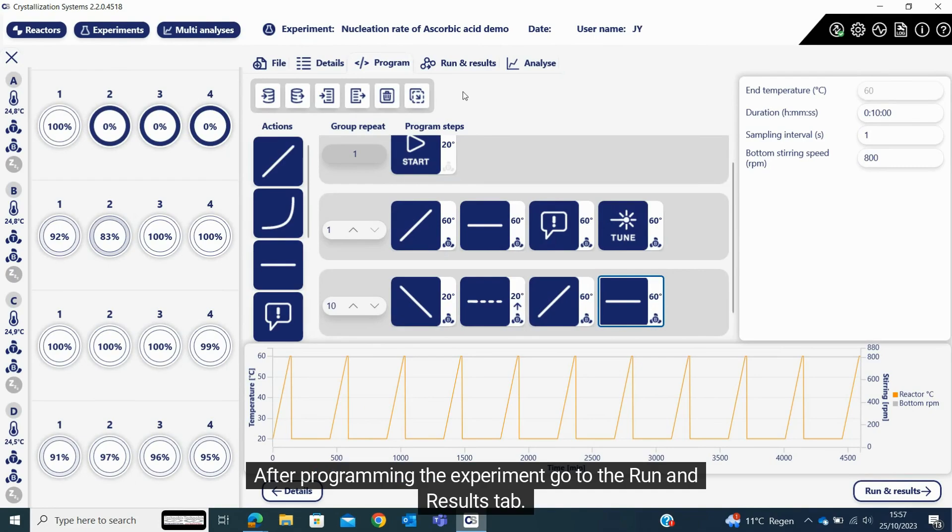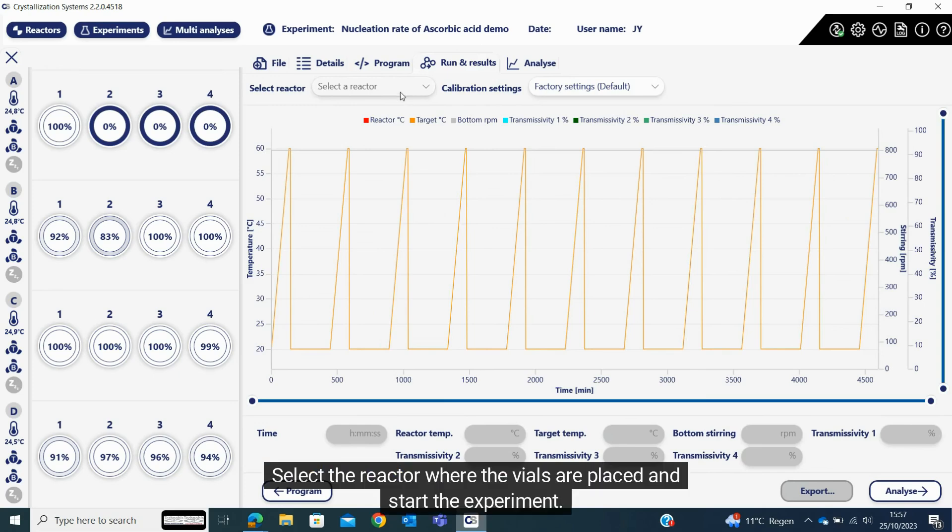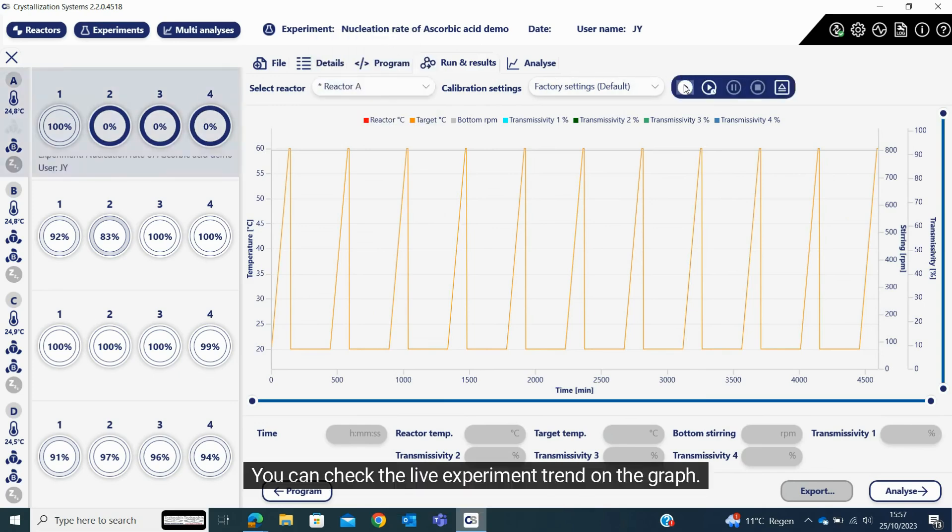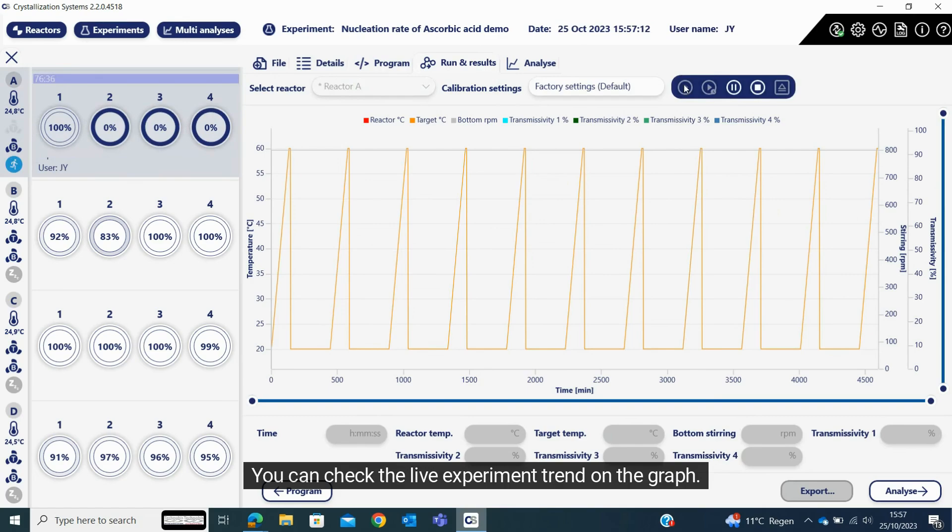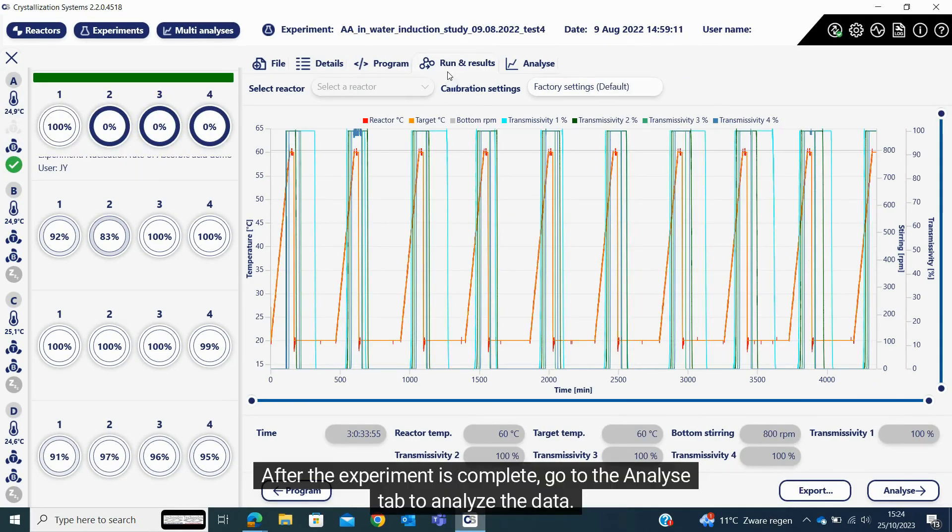After programming the experiment, go to the run and results tab. Select the reactor where the vials are placed and start the experiment. You can check the live experiment trend on the graph.